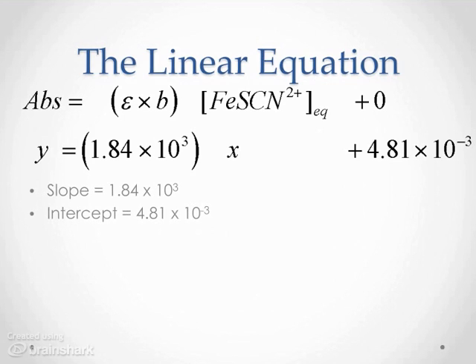All right, let's take a closer look at the intercept. So again, it's not exactly what we're looking for. It's not exactly 0. So let's think about reasons why it might not necessarily be 0. And it's not a bad thing. It's perfectly fine. It might be due to errors in dilution calculations. For example, you're assuming that you've collected the appropriate volume, but it might not necessarily be the exact volume you're using in the experiment. And you do perform a series of dilutions to actually come up with the reaction system solutions that you deal with in this particular experiment.